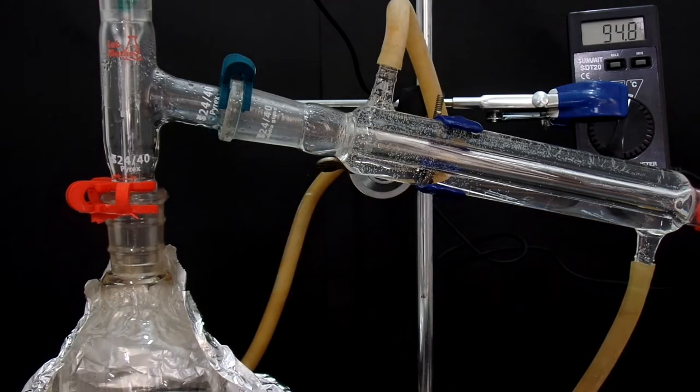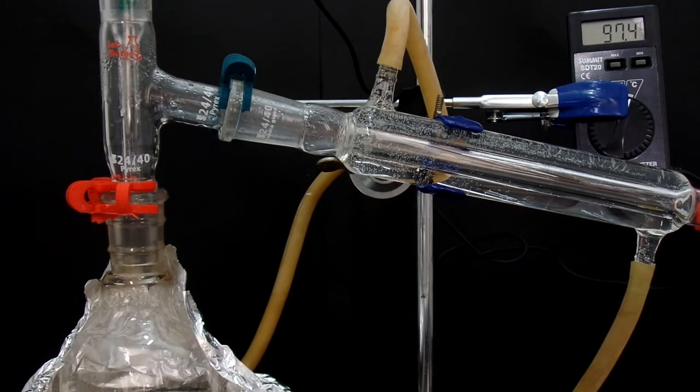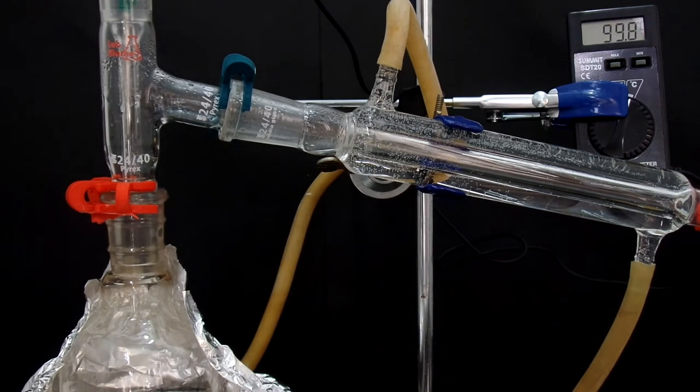Brown butyl acetate is transferred to a 250 ml round bottom flask and distilled. Butyl acetate has a boiling point of 126 degrees Celsius, but I think the thermal unit is not working correctly.